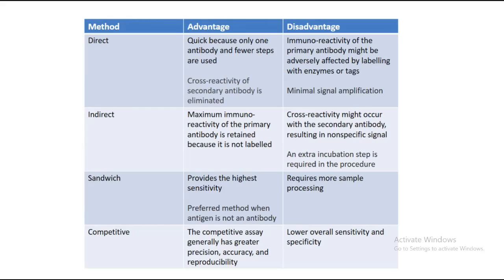The other thing is, a disadvantage is it requires more sample processing. In terms of competitive ELISA, it generally has greater precision, accuracy, and reproducibility, and the disadvantage is overall lower sensitivity and specificity.